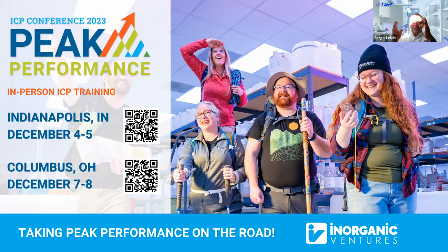One provides the sample flow, another one provides the internal standard flow. So the sample pump tubing, which could be, for example, orange and black, could be in good health, but the pump tubing that delivers the internal standard solution, which is usually much smaller diameter to minimize the dilution of your sample, is either orange green or orange blue or whatever. It's very tiny, around 0.2 millimeters plus or minus. So if that tubing is worn, then this is where your problem is.